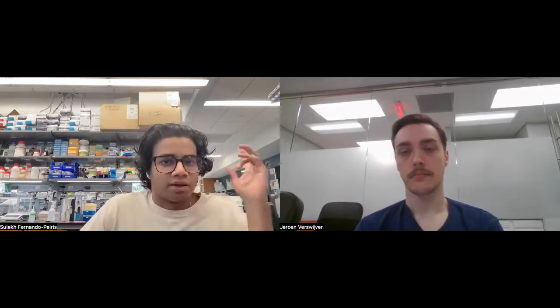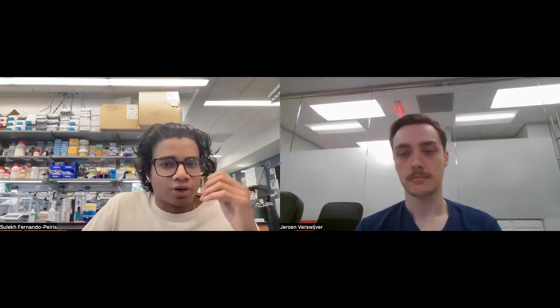So my first question, for me and the other members of the lab, is do you guys have a demo? I saw the little GIF online of how your LabBook GUI works, but do you have a demo of more detailed entry, adding inserts, or filtering the data in LabBook that we could see?